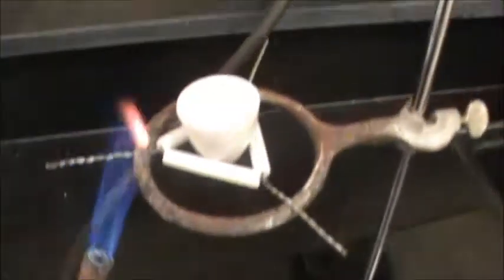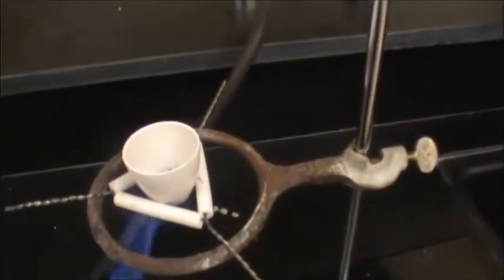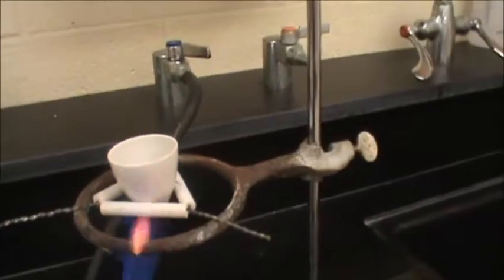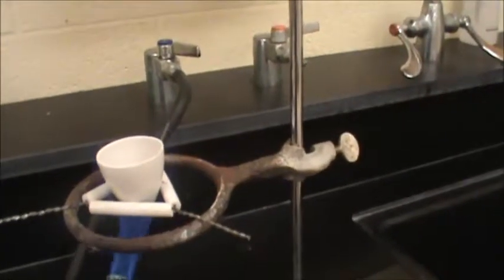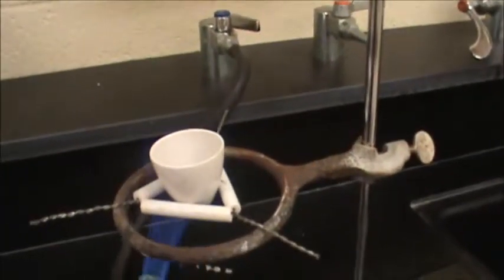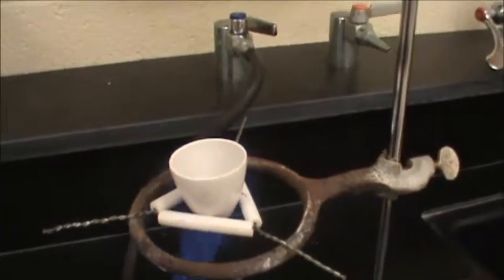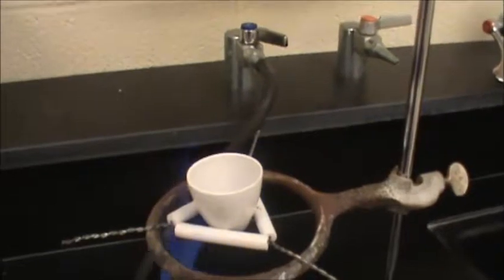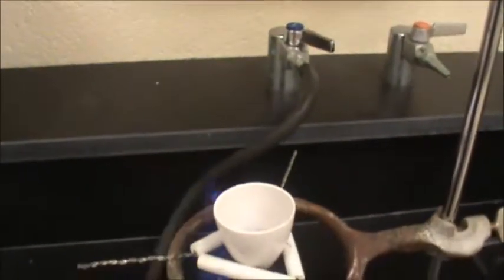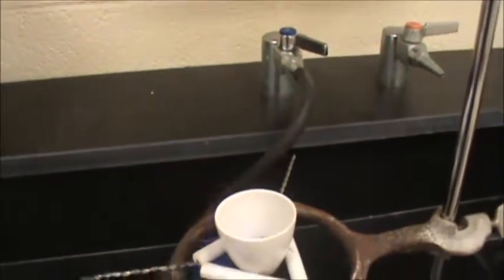So first thing I want to do is just get it toasty warm. So I'm just taking the flame and, as you can see right here, kind of tickling it. Alright, just trying to get it up to temperature so we don't shock it with a lot of heat. So as I slowly heat this up, I'm doing this for approximately 2 minutes.